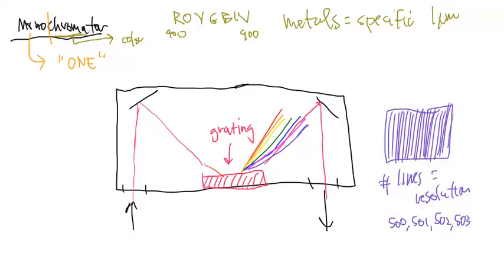That's the monochromator. That's its job. It takes the light that it's being given and it divides the light up into the individual wavelengths. And this is what we mean by that. And it begins to scan every single one of those wavelengths that it needs to for the analysis. Now, if I have more etched lines, I increase the resolution.